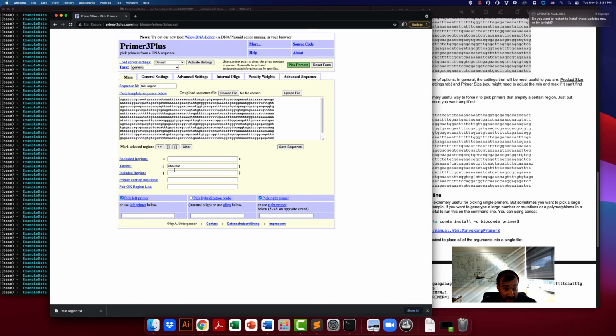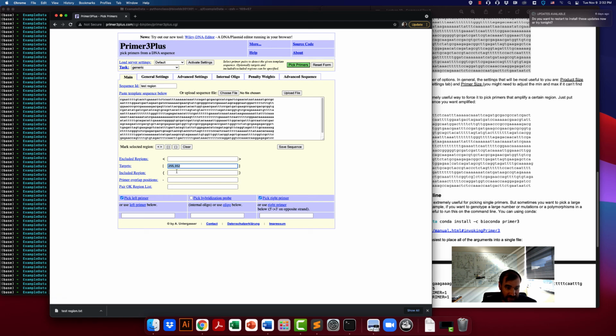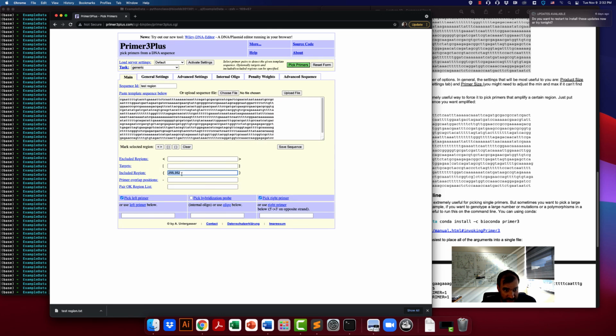And so again, you could also use that syntax. So this has actually just translated what my brackets were, but you can also use that syntax in the targets. So there's kind of two different options that you can use. And then finally, included region is probably what you think.